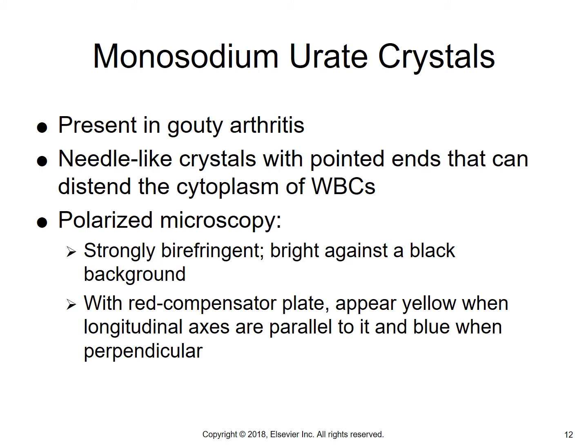Sometimes you have cases where both monosodium urate and calcium pyrophosphate have been found together, but clinically significant crystals will not have any irregular or jagged edges. That will be artifact. So let's talk about the most important types of crystals here.